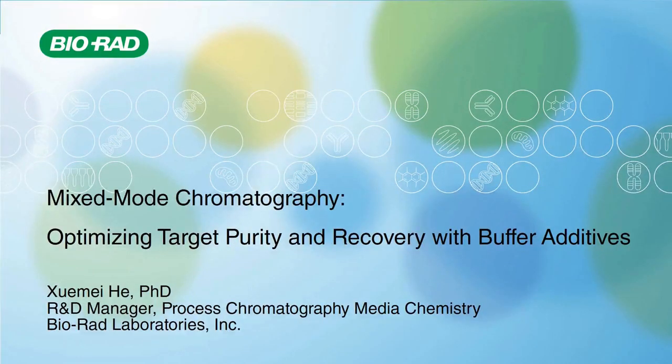Thank you, Leah, for the introduction. Today, I'm going to talk about the use of buffer additives in mixed-mode chromatography for the optimal target purity and recovery.